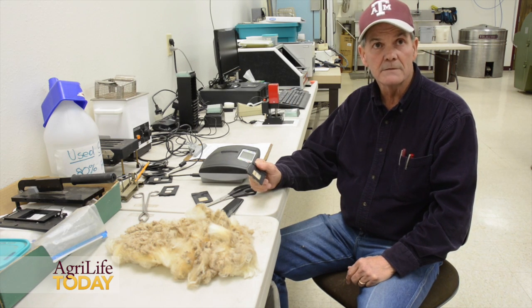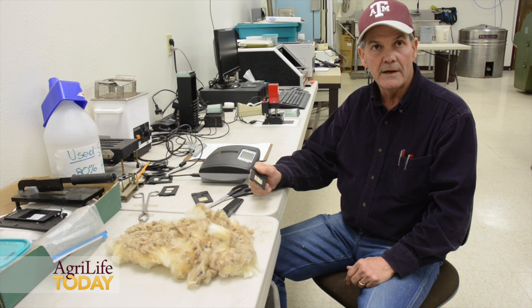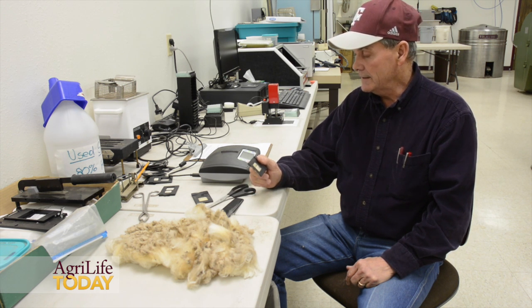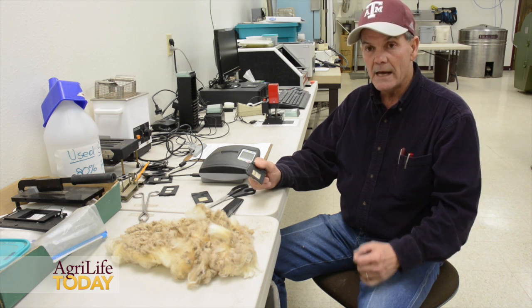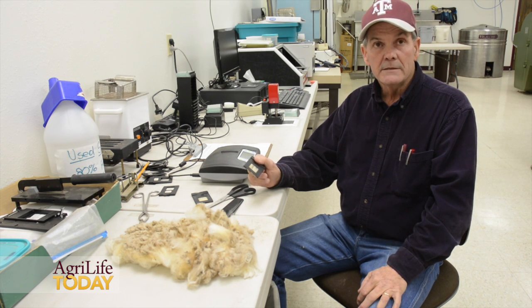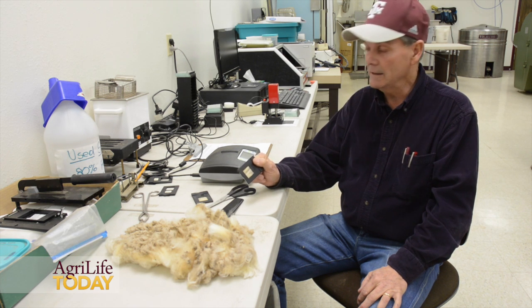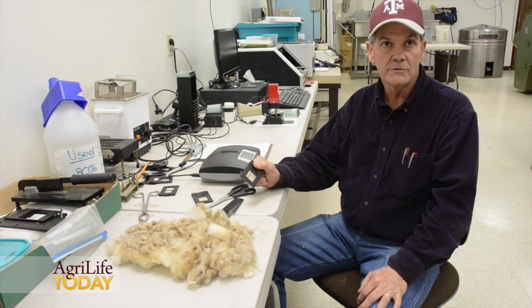This is the FiberLux instrument, developed and manufactured in South Africa. It's designed to be a relatively inexpensive piece of equipment that is accurate and easily used by growers.